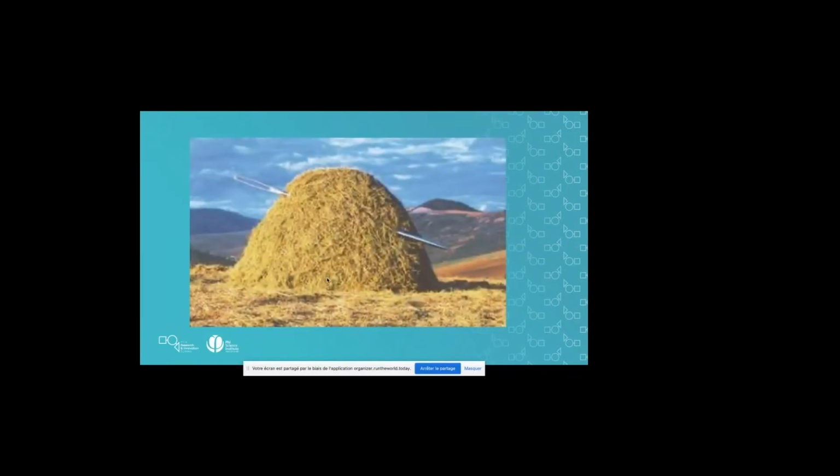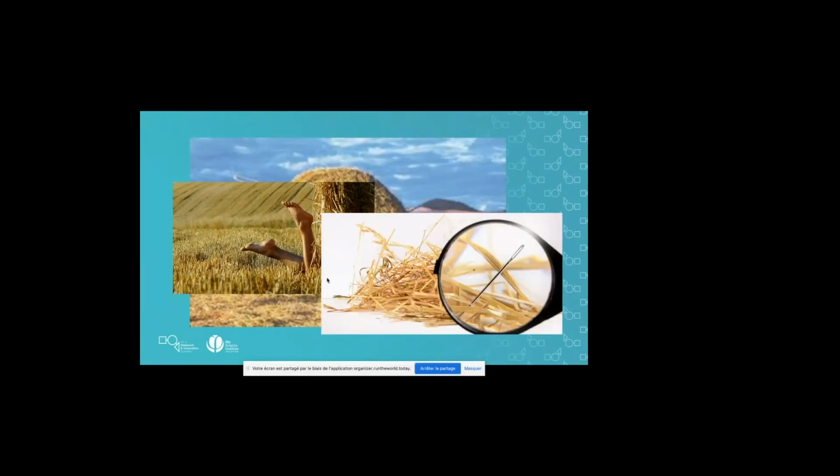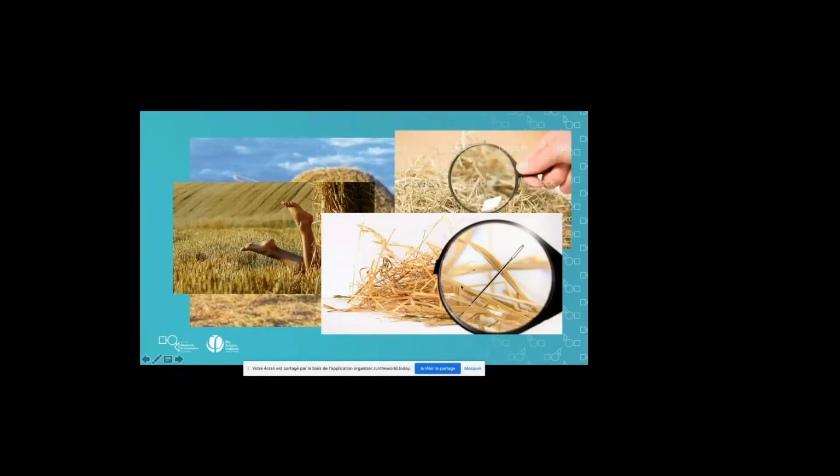And so looking for the variant behind the disease is like looking for a needle in a haystack, but the needle is not clear that way, as I represented here in the figure. You have instead to have a closer look at the sequencing results while being well equipped with the necessary bioinformatics tools to examine the data. And keep in mind that in the majority of cases, the situation is not clear like this photo, but it is very confusing like that.